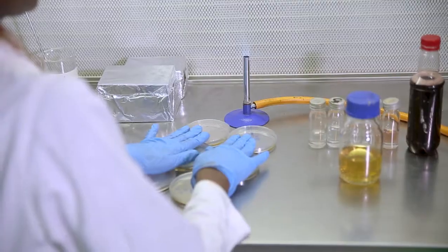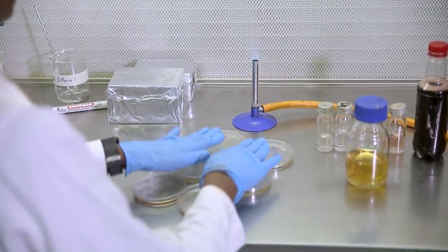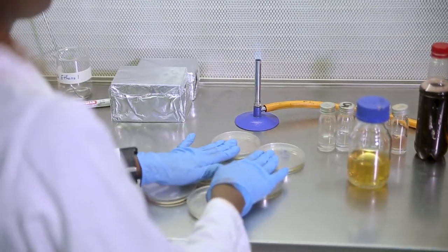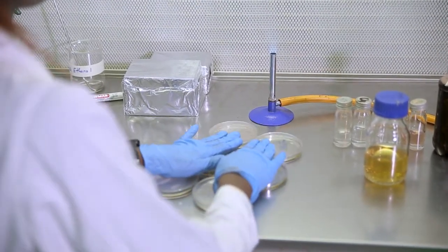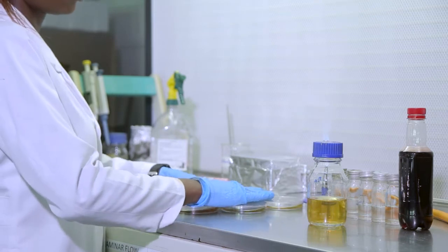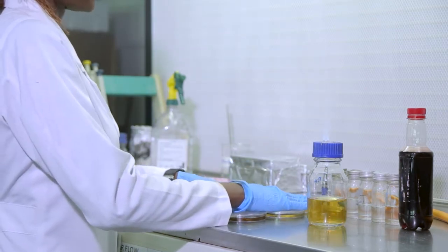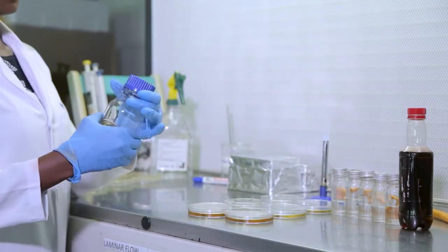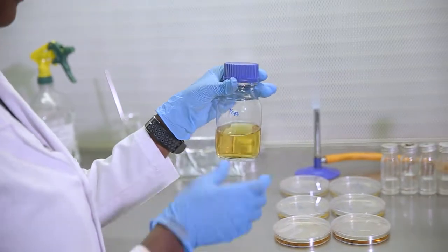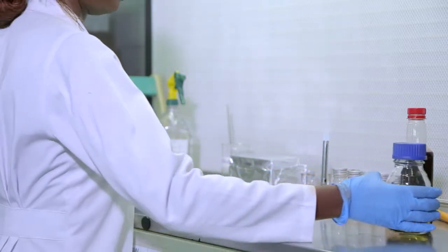So the important thing, you have to make sure that the agar and the inoculum have mixed very well. You could also do letter M if you want, forward and back, to ensure that the two are well mixed. So we can leave this on the bench for about 10 minutes. The agar will solidify. This agar can be put back in the water bath to prevent it from solidifying, especially if you have other samples to work with.